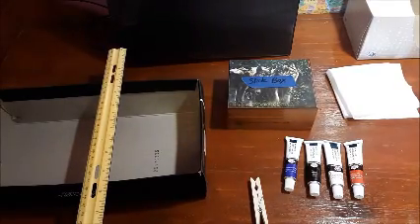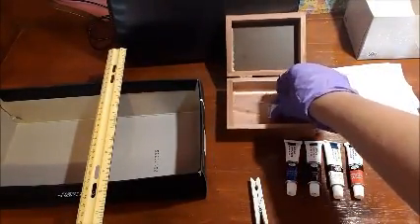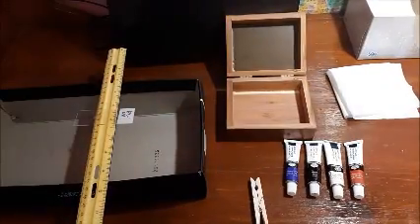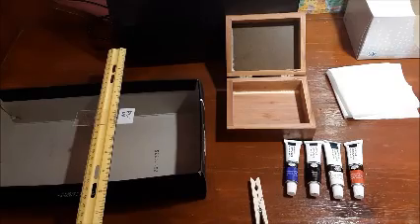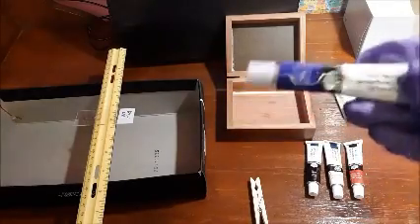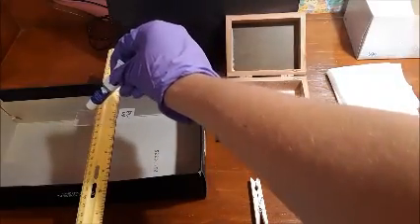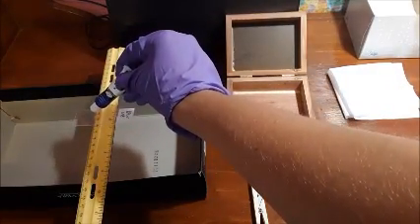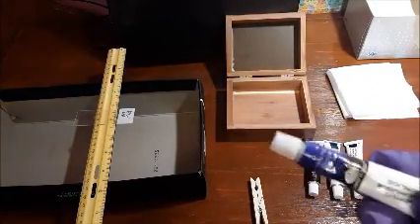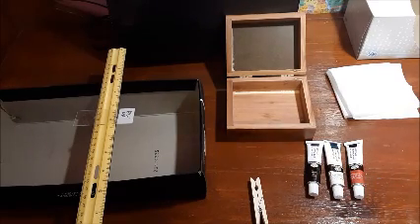To start this experiment, you're gonna take your heat fix slide that you made earlier, this guy right here, and put it on the stain tray. Now that the slide is on the stain tray, you can apply your first stain, which is your crystal violet. Like I said earlier, this is your primary stain. So you're going to apply this to the slide for about 30 seconds. Now I'm just going to speed this up a little bit, but once you've applied that stain, let the slide sit for about 1 minute so that the stain can seep into the smear.